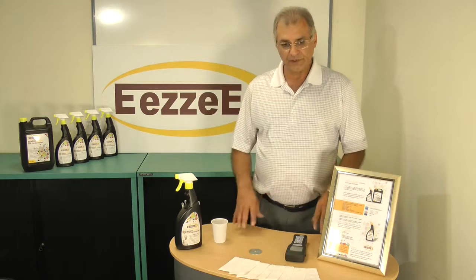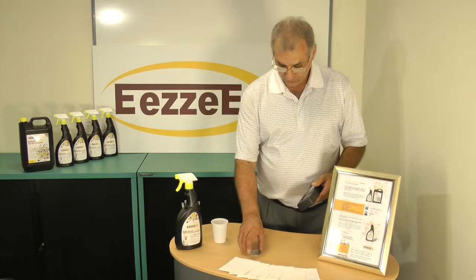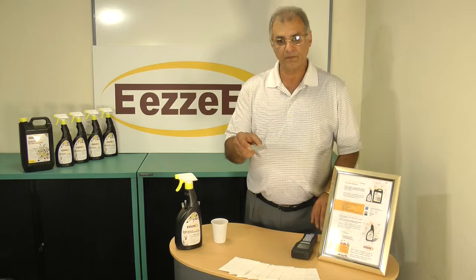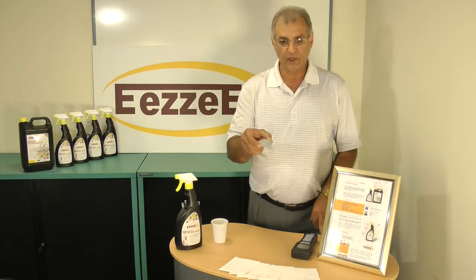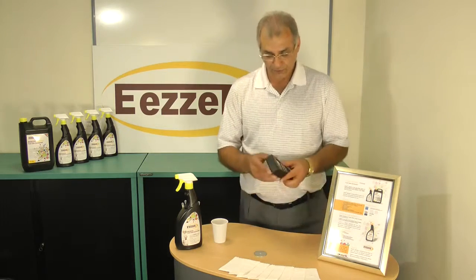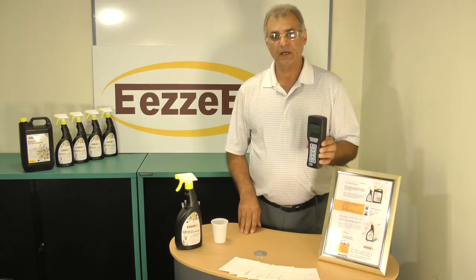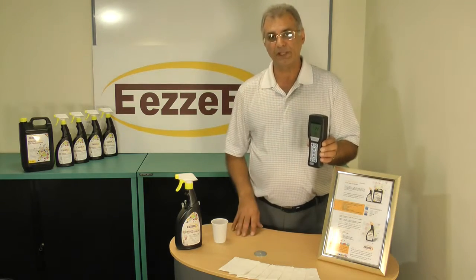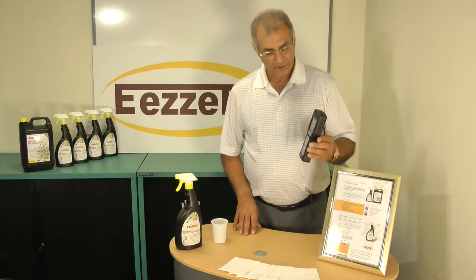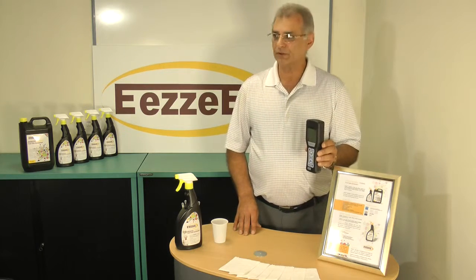In order to demonstrate that, we use an ATP machine to measure the bacteria count on this piece of steel, which we have previously applied some germs and bacteria to for demonstration purposes only. In order to do that, first we must calibrate the ATP machine, which means the machine will be set to zero, and then we can start taking the measurements. It takes approximately 15 seconds for the machine to set to zero.